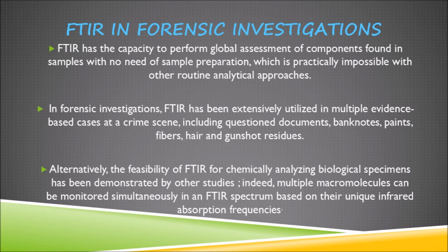Alternatively, the feasibility of FTIR for chemically analyzing biological specimens has been demonstrated by other studies. Indeed, multiple macromolecules can be monitored simultaneously in an FTIR spectrum based on their unique infrared absorption frequencies.